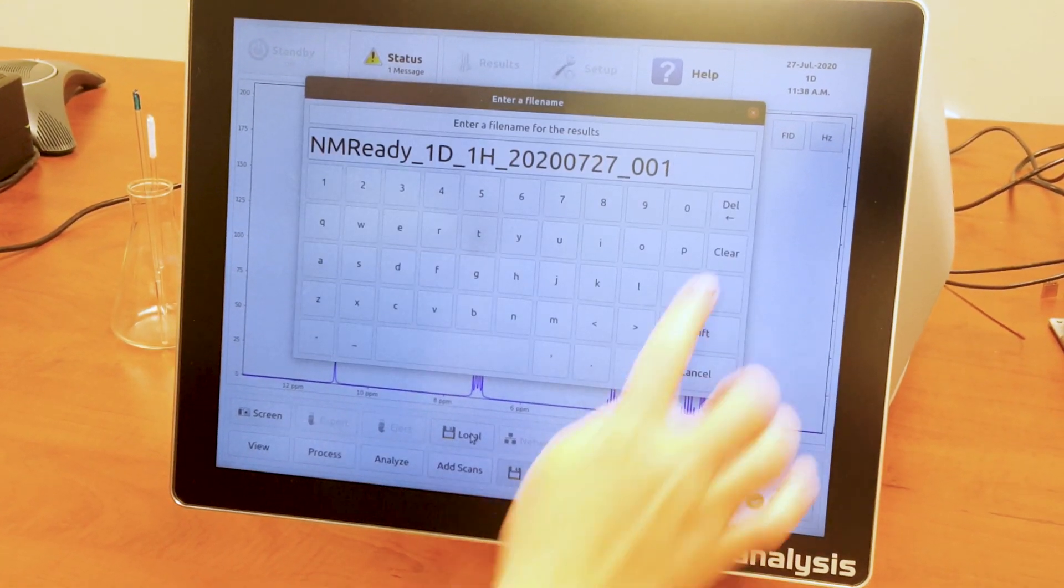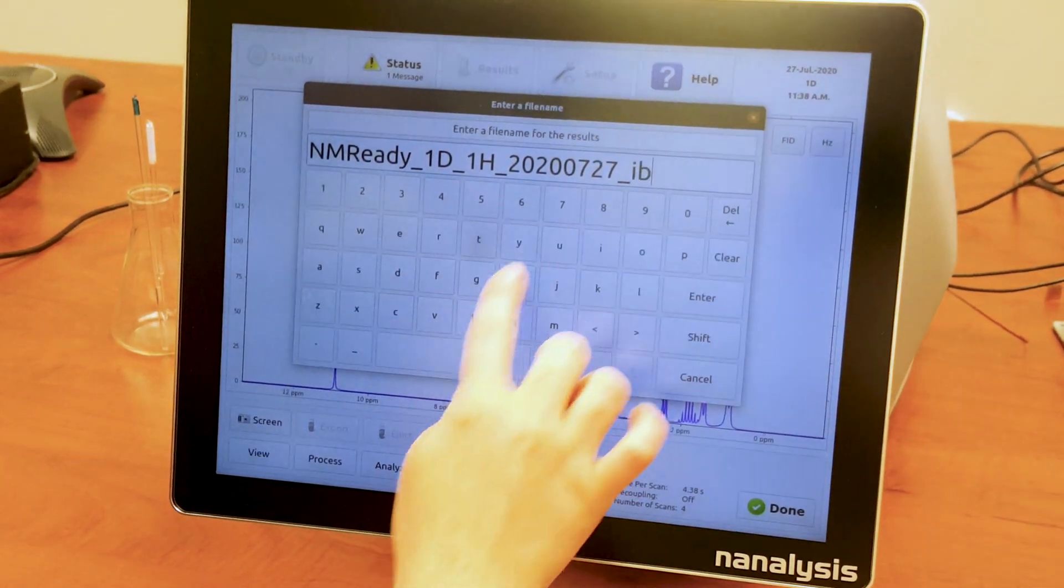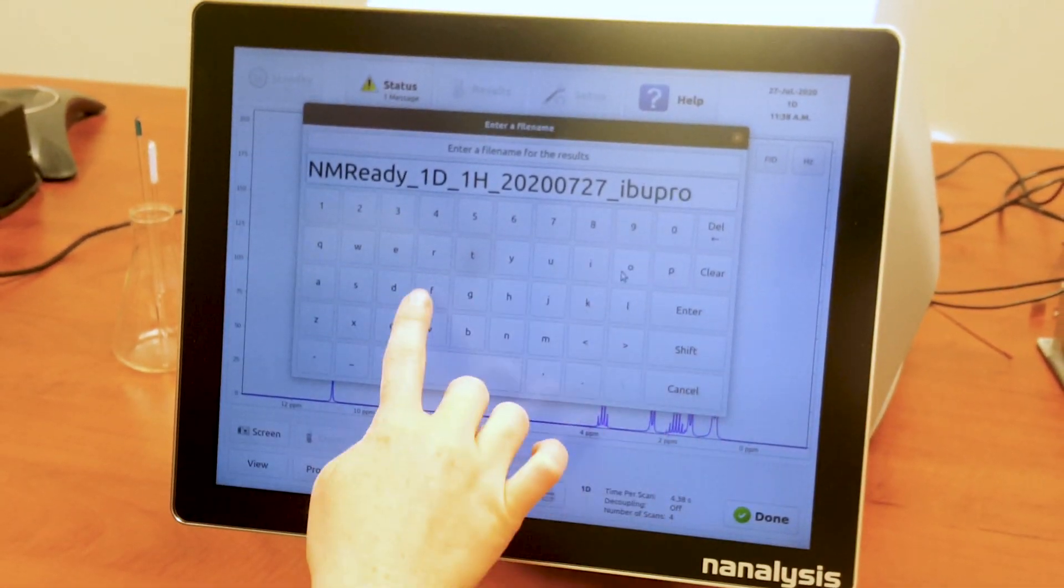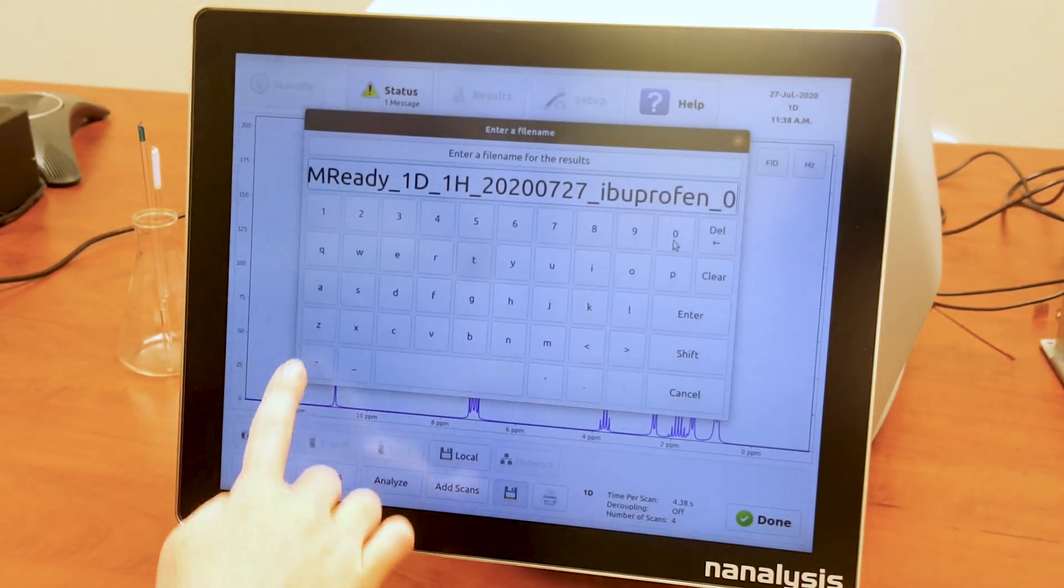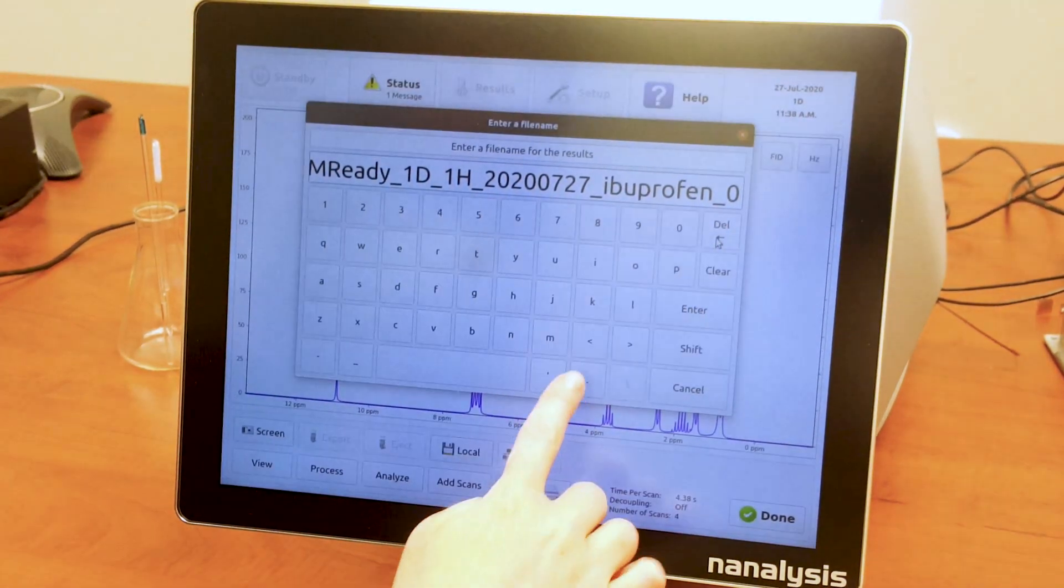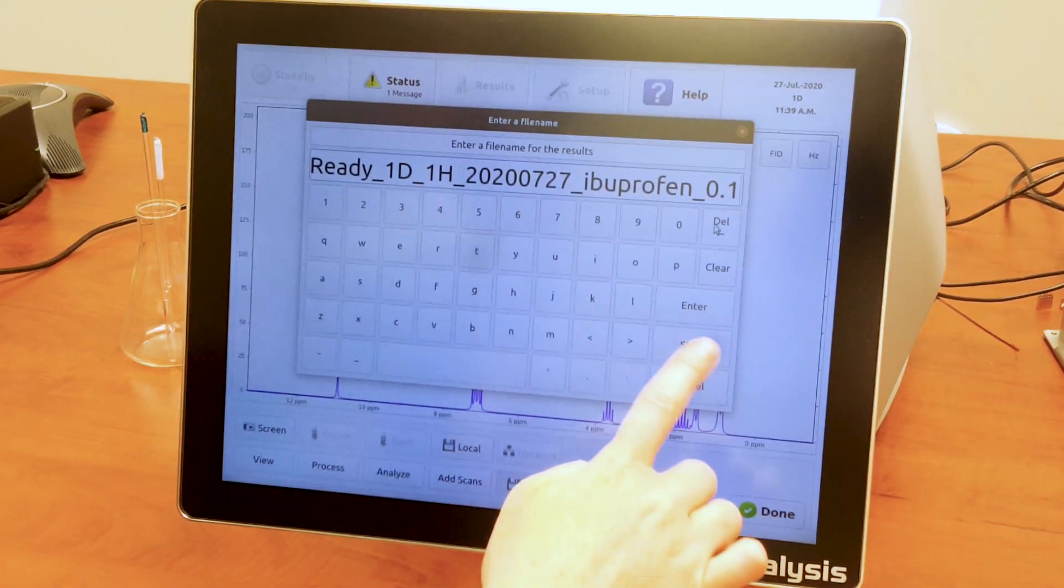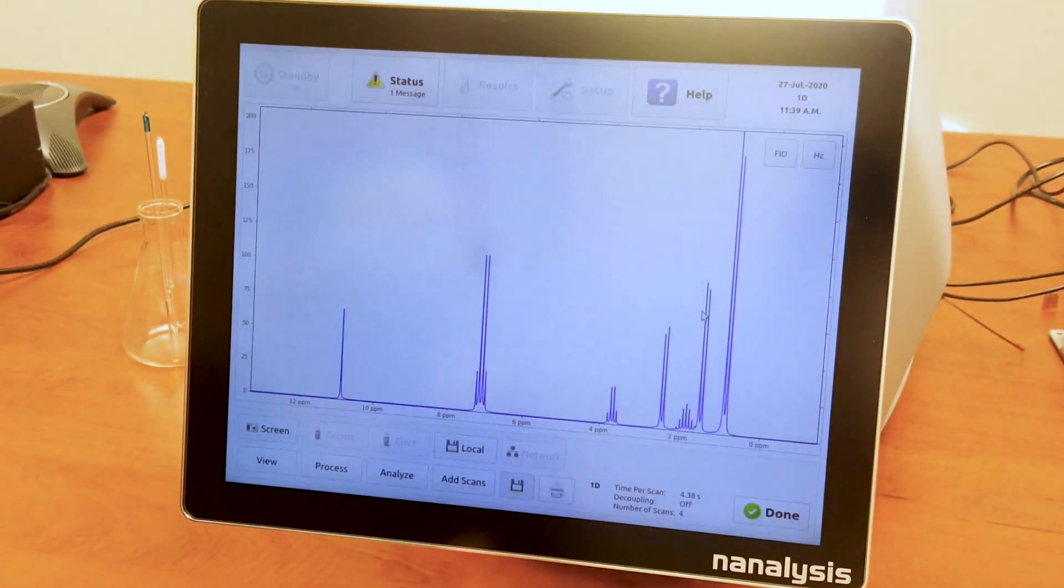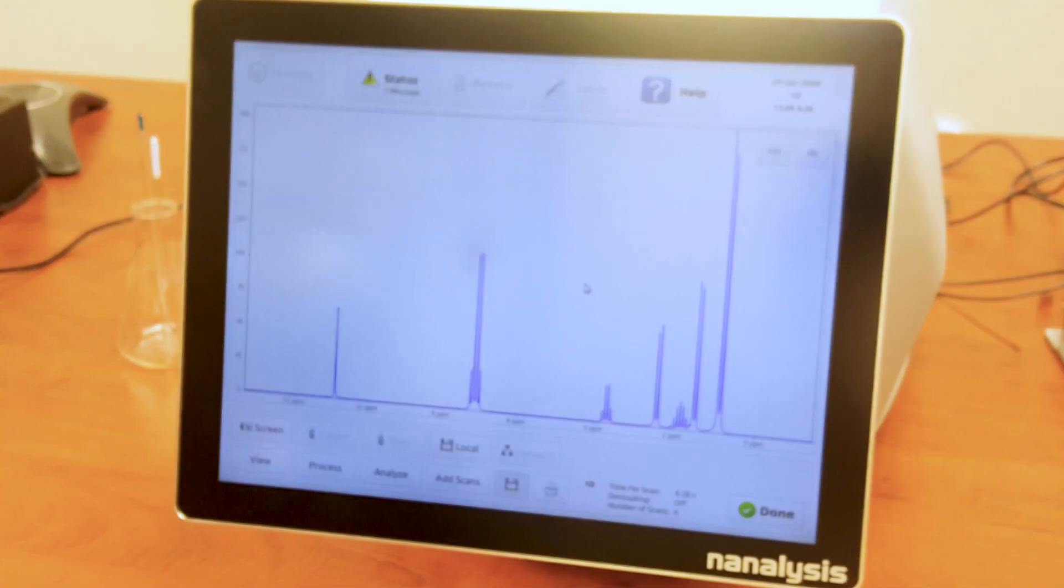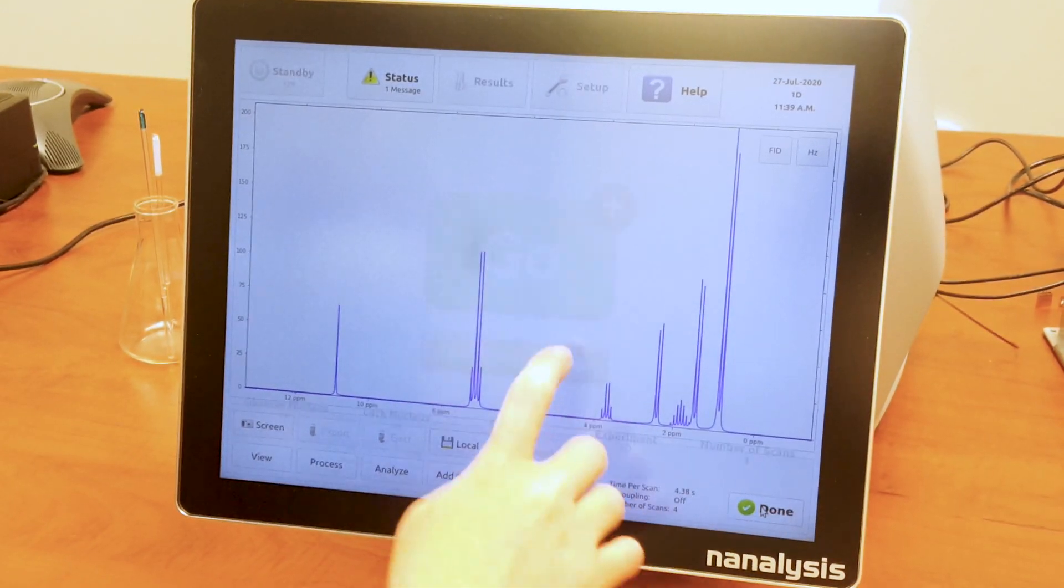Data can be saved directly on the computer, a USB memory stick, or a network folder in JCAMP-DX format to be processed elsewhere, or as a PNG or PDF. Also, saved data can be loaded back into the instrument and processed as desired.